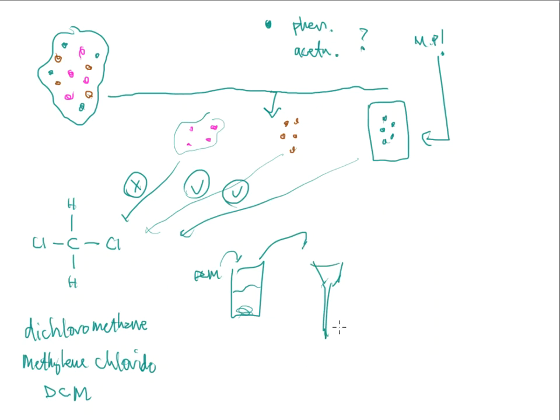And when I pour that solution through the funnel, all of the liquid that goes down below, this is what I'm going to keep, because now it has 2 components in it. I'm going to have some solid crud that's left off in the top of the filter flask. And that solid is going to be my sucrose.